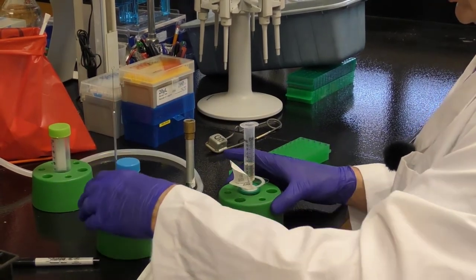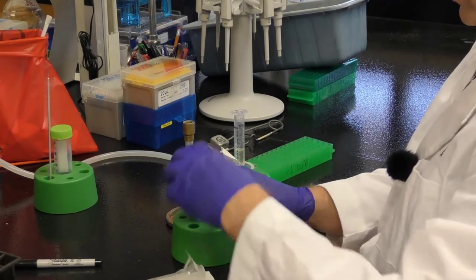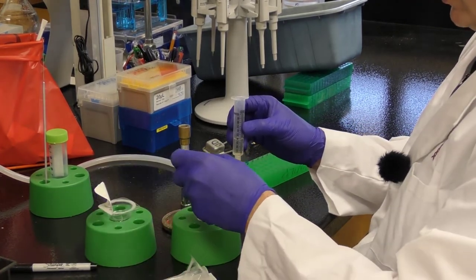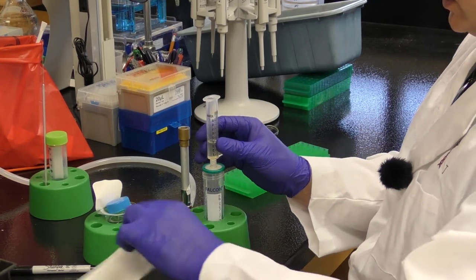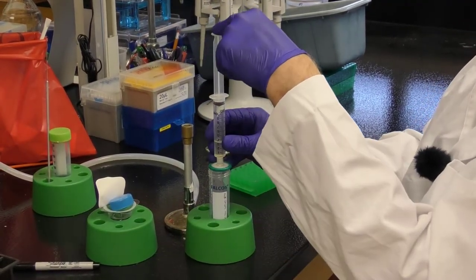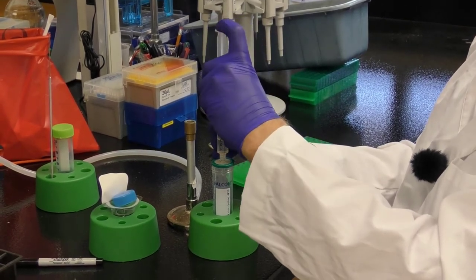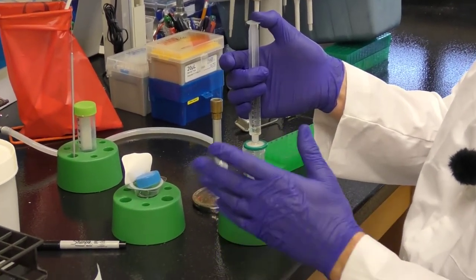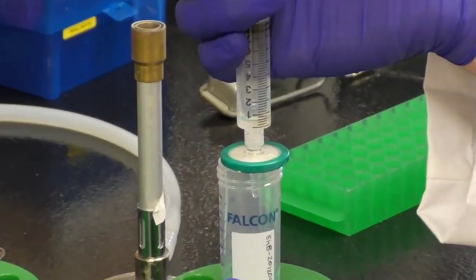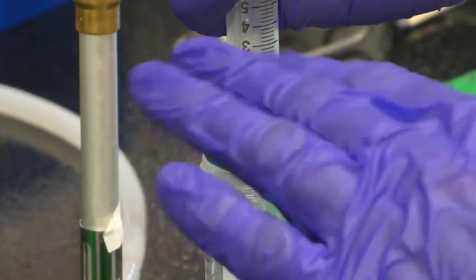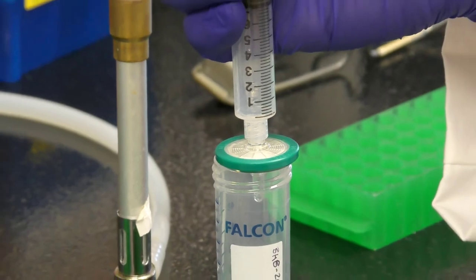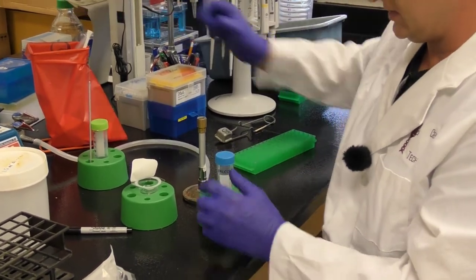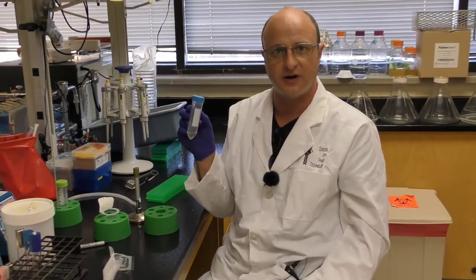We take our sterile fresh tube and loosen the cap. What I can do, I can take the cap off and place it here again because I know that's sterile. Take the plunger. I'm making sure that I'm only going into the tube. I can place the plunger on and just slowly start to press through. You don't want to use too much force. You can just completely blow through the filter. So you'll then have to completely repeat again. If you're finding you're having to really press down, then the filter's clogged, so we just replace the filter. Your TA will help you with that. And once all the material's through, the cap goes back on. That goes in the biohazard. And now we have our filter sterilized high-titer lysate.